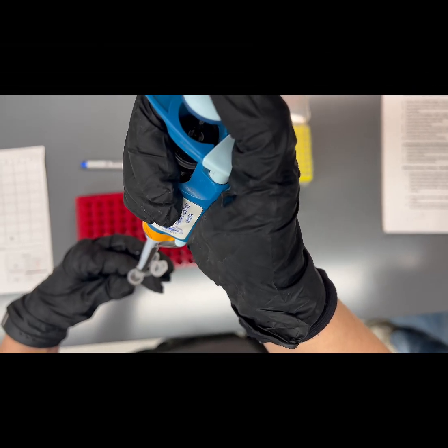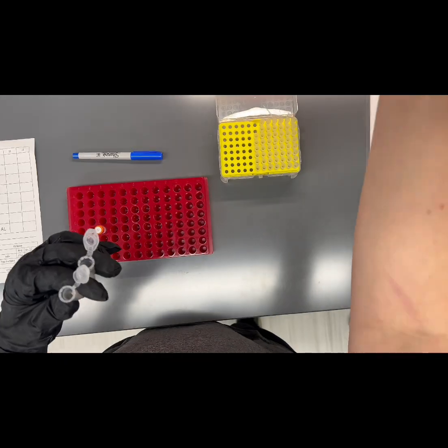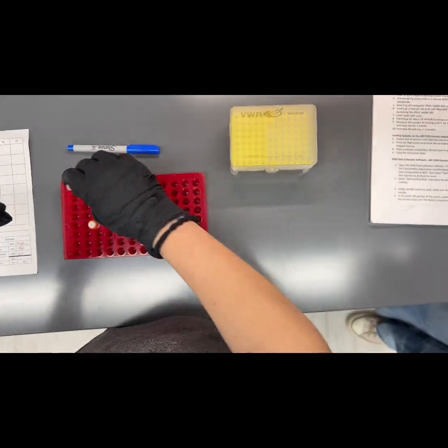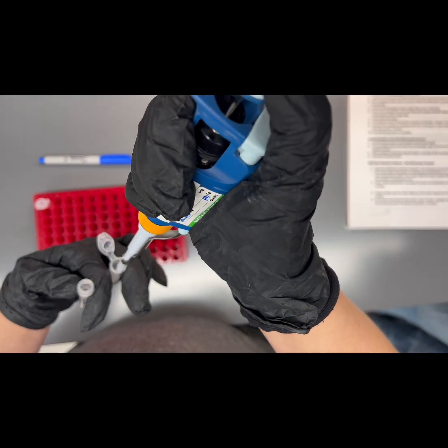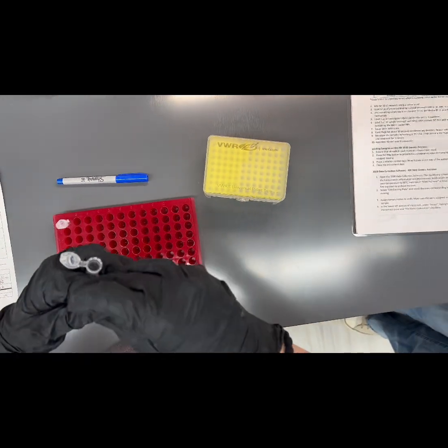Before injection into the CE, DNA samples must undergo sample preparation. First, a master mix is made and added to the CE plate. The master mix includes high-dye formamide and the internal lane standard. High-dye formamide and internal lane standard are added to each sample. The high-dye formamide is included to ensure that the PCR products are denatured, making them single-stranded.